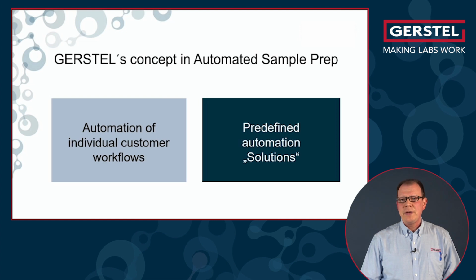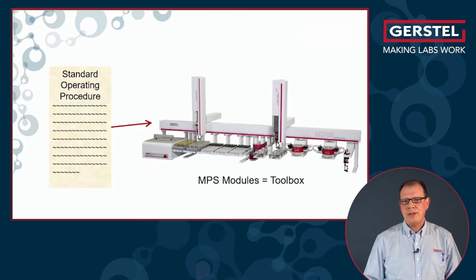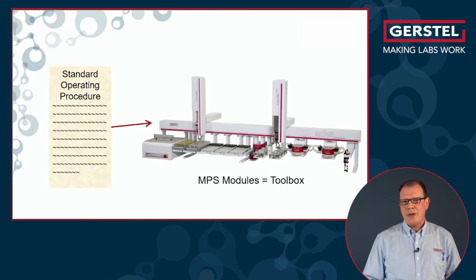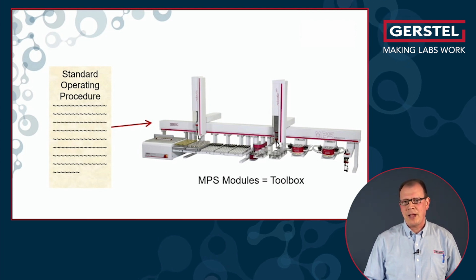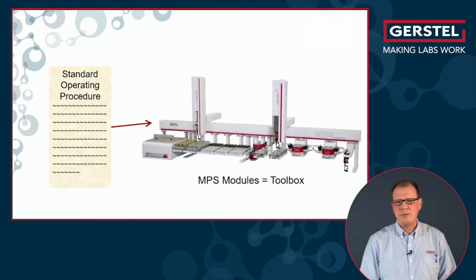If you take a look at translating your SOP into automation, then of course, as I said, we take the MPS, but the MPS comes with a lot of modules, and these modules can help to automate different steps. The modules serve as some kind of toolbox for your automation.